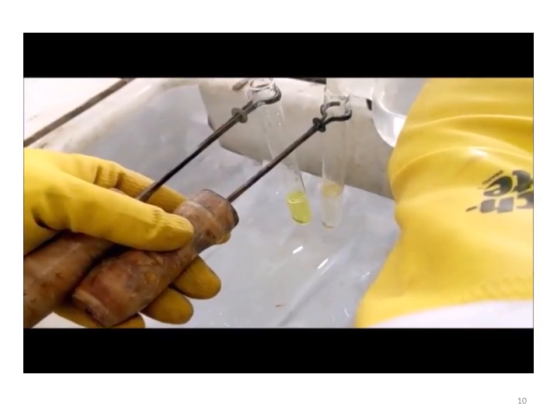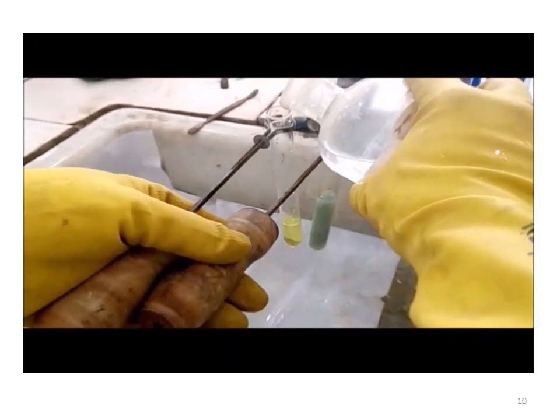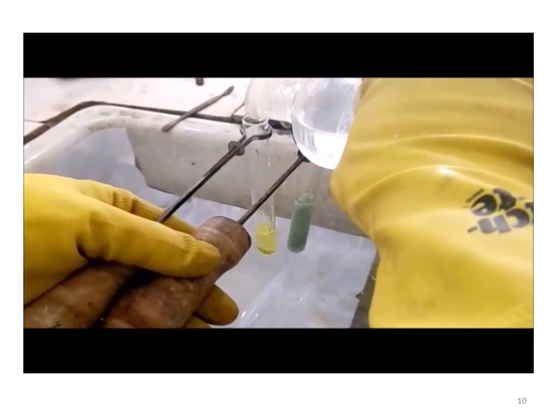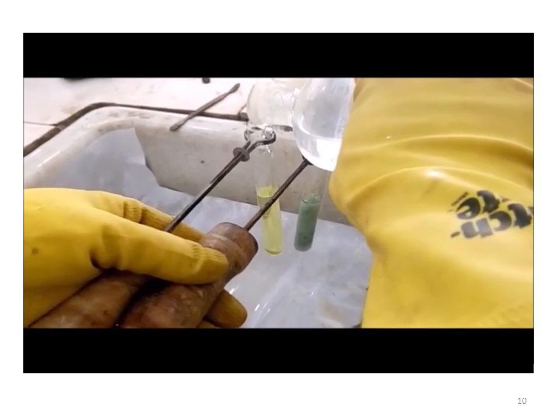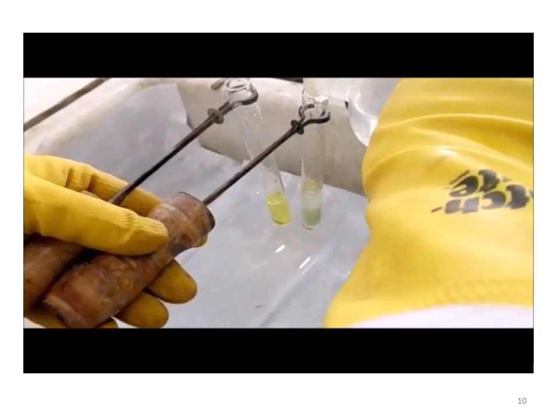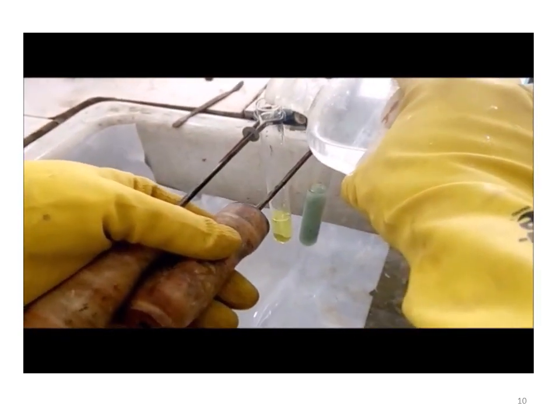Okay, in the first step we are adding ferrous sulfate and sodium hydroxide. You can see in the first test tube ferrous sulfate has already been added, and in the second test tube potassium ferrocyanide is there. In both of these test tubes sodium hydroxide will be added.